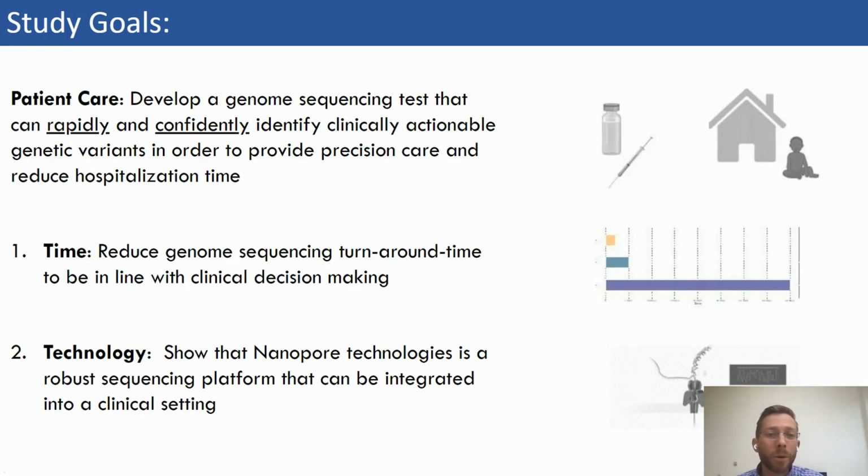The second aim or goal of our study was to show that this new sequencing technology developed by Nanopore is a robust sequencing platform that can be integrated into a clinical setting.